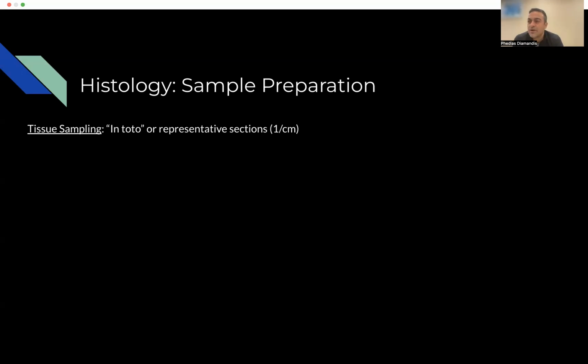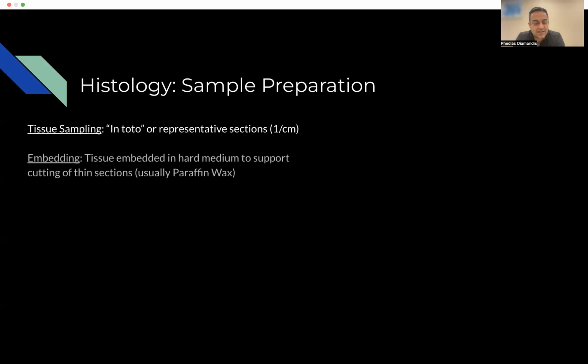So some tumors where even a small component may be important for therapy, such as germ cell tumors, may require more extensive sampling, even if it cannot be done in toto. Whereas in other areas of pathology, 1 section per centimeter is usually sufficient to get an overall sense of the biology of a specific sample. So again, this really depends on the context of the specific specimen and what the implications are of a small subcomponent that may have an impact on therapy and outlook.